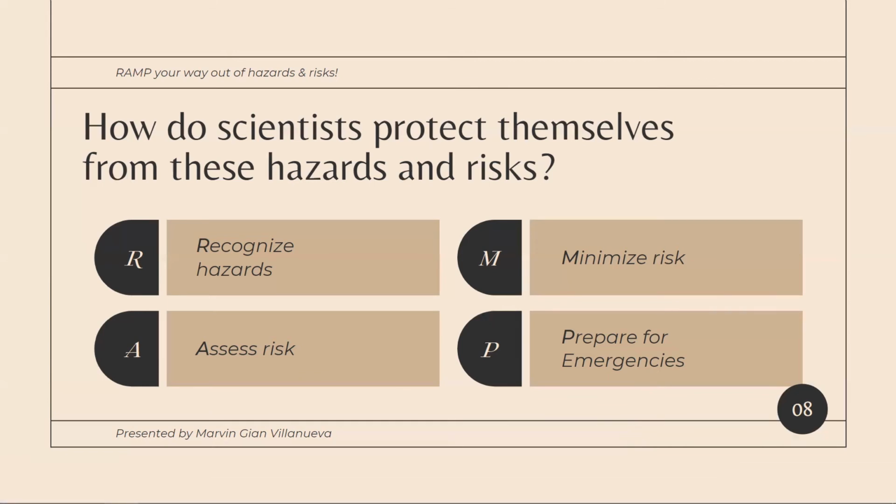Despite recognizing hazards, assessing associated risks, and minimizing them, there will always be potential accidents and errors that might occur while doing laboratory work. Being prepared is critical for mitigating effects of the danger that may come along. Additionally, there exist standard microbiology lab practices and safety rules and established laboratory biosafety levels that a scientist can follow to protect laboratory personnel as well as the surrounding environment and the community.